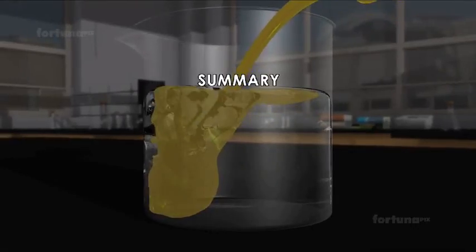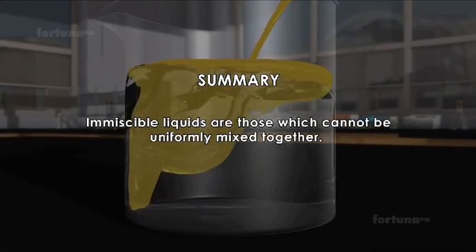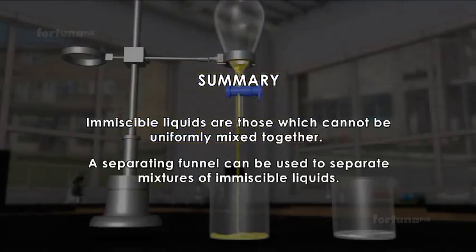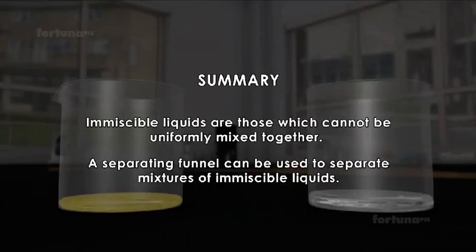Summary. Immiscible liquids are those which cannot be uniformly mixed together. A separating funnel can be used to separate mixtures of immiscible liquids.